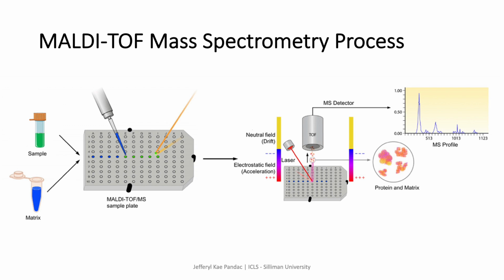After drying, the mixture of the sample and matrix co-crystallizes and forms a solid deposit of sample embedded into the matrix. The plate is subsequently loaded into the MALDI-TOF instrument and analyzed by a software associated with the respective system. The MALDI leads to the sublimation and ionization of both the sample and the matrix.